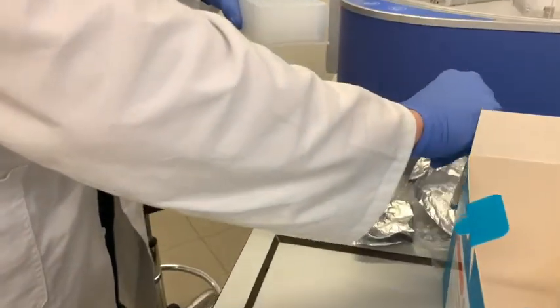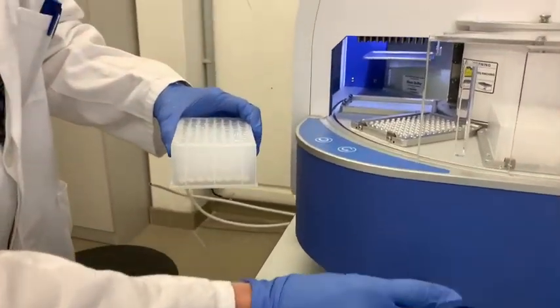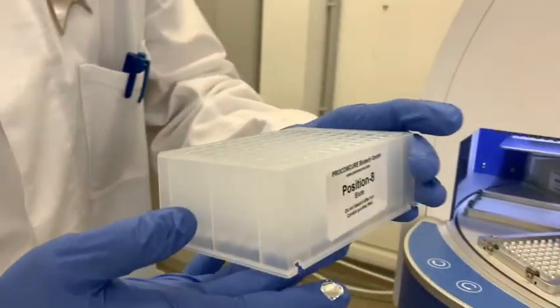The elution plate at position 8 is important because this is where the samples are placed at the end.